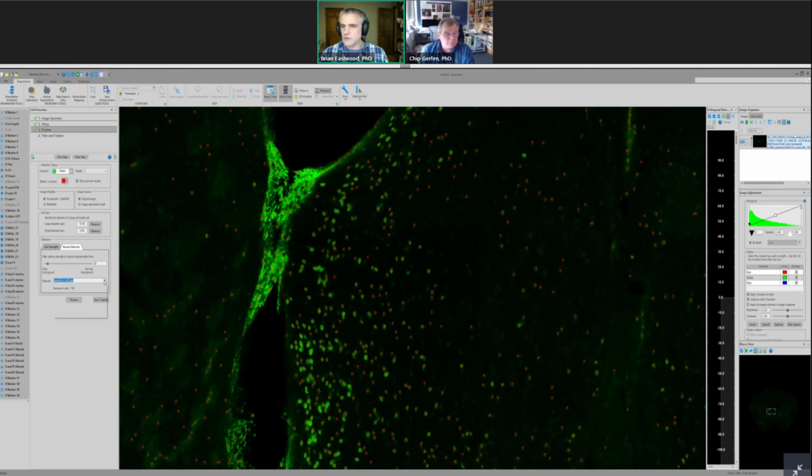As we saw with the pyramidal cells, we're pretty far along in the process for pyramidal cells. With FOS, we're still working on it, still a work in progress. For pyramidal cells, we have somewhere around 90,000 or so images that we're working with. And with FOS, I think we're up to around 18,000 or 20,000 now. Still growing, but we don't have quite as many examples that we're drawing from yet for FOS. But we also have a bunch of different iterations that we can look at for how this network has improved over time.